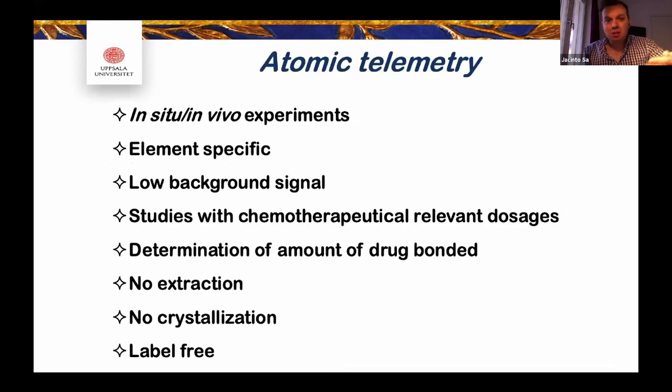The thing to say about atomic telemetry is that it encapsulates everything that I wanted to do when I started doing work with X-rays. Basically, it's an in vivo or in situ type experiment where you really measure the things under the conditions that you are interested in. It's elemental specific, and you use this in your favor. Like I said, if you compare with vibrational spectroscopy, where everything will contribute to the signal, it is an absolute nightmare. Here is a completely clean signal from the drug.